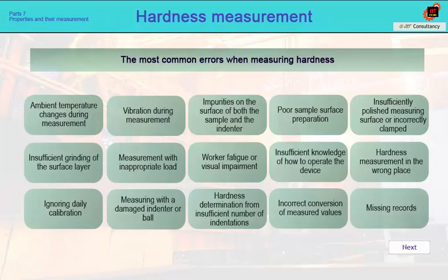But they are far from all. That is why such great emphasis is placed on the qualification of personnel. What we really measure are values that can have negative impacts on the actual and real physical properties of the part after heat treatment. However, these values, if measured incorrectly, can also have significant legal consequences because they are part of the contract between the customer and the heat treater. Incorrectly measured values can then constitute a violation of the provisions of the contract.